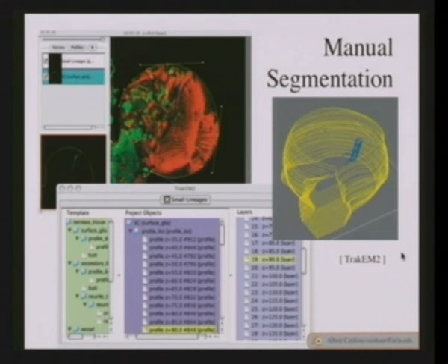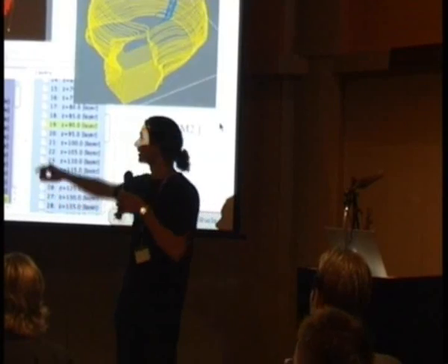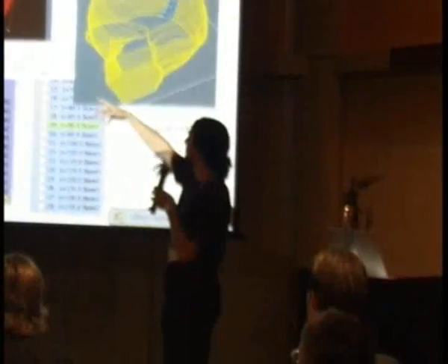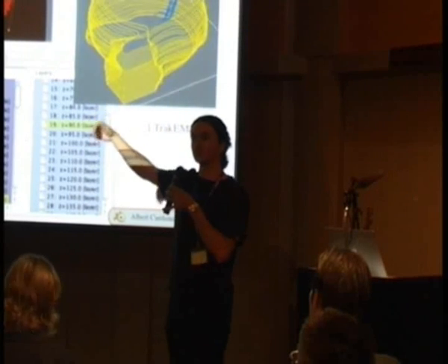I created this program in ImageJ, which is a very nice public domain application for handling images and image analysis. It has literally about 1,000 plugins, all open source GPL, to do whatever you want. It's Java based. I can load in as many images as I want, and I created these tools to create, for instance, Bezier contours of different aspects of my images.